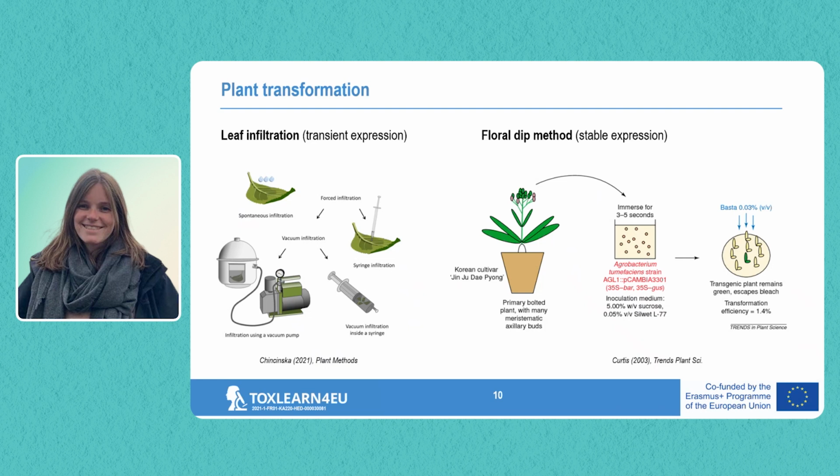And then you need to select which seeds actually are the transgenic seeds, so which ones contain this protein that you inserted there. And you can either do that just by growing the seeds on some agar plates. And then in our case, because we're using a fluorescent protein, you can just very easily see under a microscope which of the plants are fluorescent.